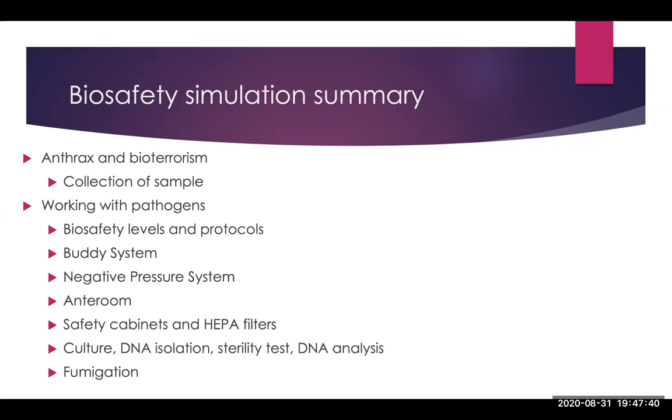And the labs that you've been in already, like chemistry, general bio, anatomy, those are just BSL 1, biosafety level 1. The microlab, when it was in person, was BSL 2, and then the simulation is BSL 3. Okay. I've actually never even been in a BSL 3. They're not that common because it's a big operation.